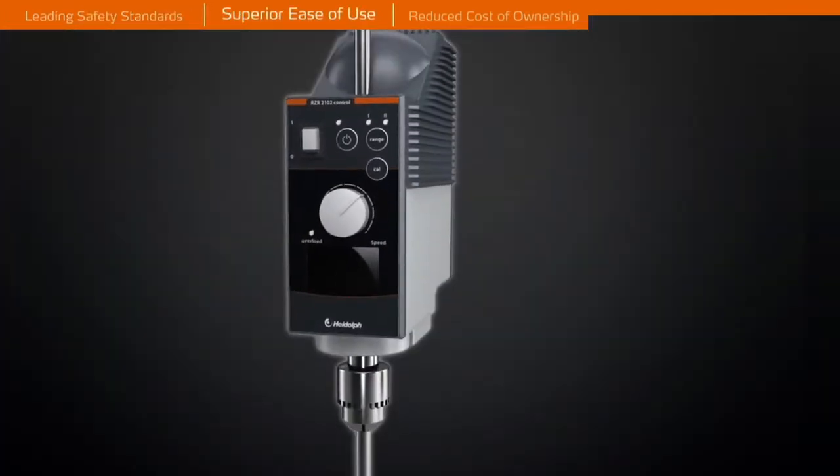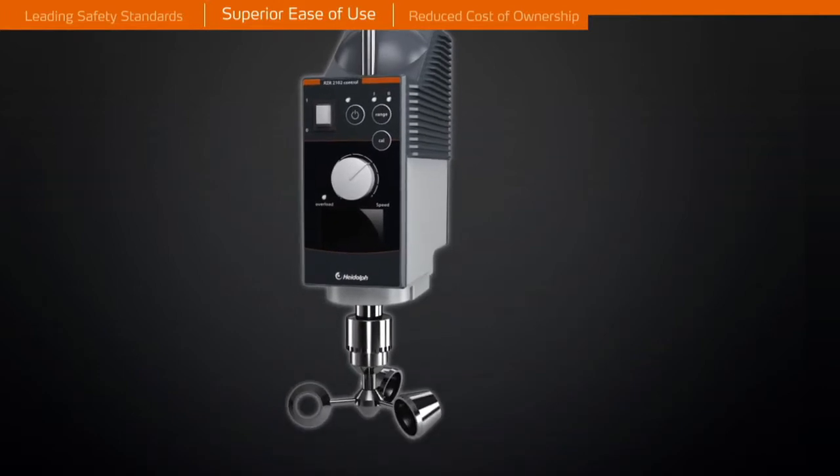To utilize limited space more effectively, a through-shaft design allows for height adjustment of the impeller in every desired position.